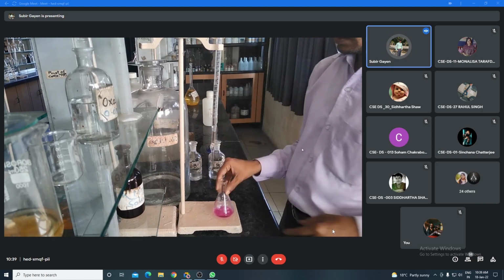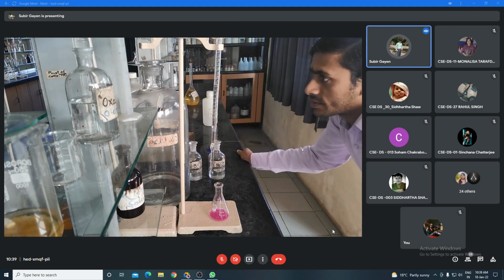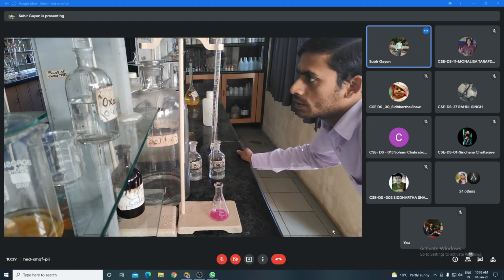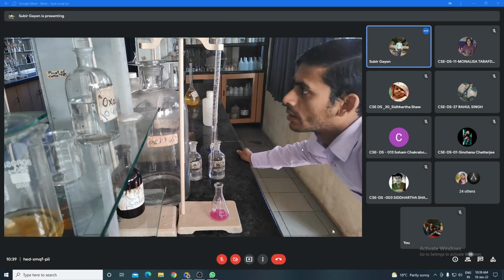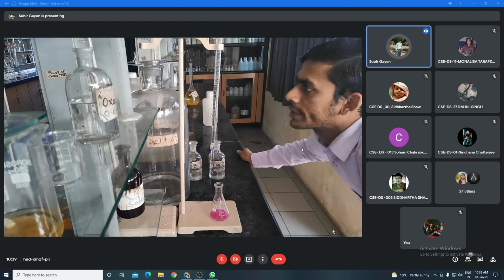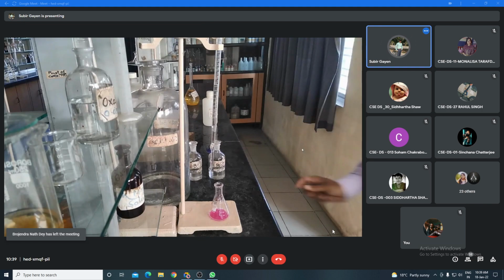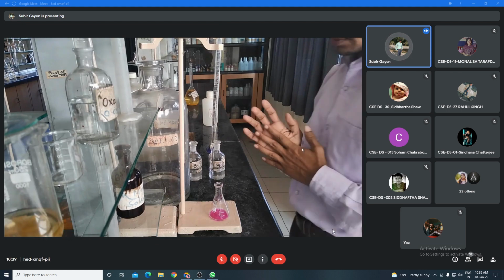So again, the second one is also complete. Initial was 40.1 and the final is 41.5.